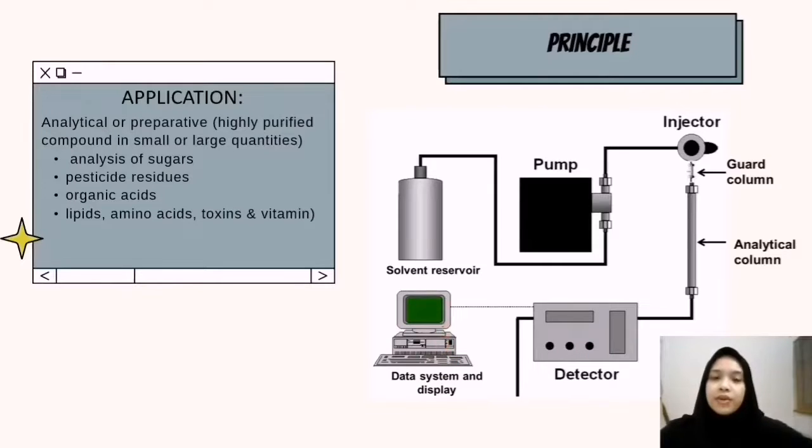So in this video, we are going to discuss further our topics, which are, first, the determination of vanillin as a flavoring agent in chewing gum by using gas chromatography, and also the determination of vanillin in alcohol extract by using high performance liquid chromatography.